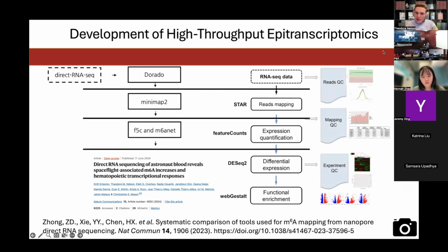So in the sense of an RNA-seq experiment, every time you do a new RNA-seq experiment, you run a very standardized protocol and you get expression, gene counts, outputs, and the like that are readily interpretable. Whereas in other contexts, what if you needed a control for all of the technical aspects of the way that you made the RNA sequencing preparation library?